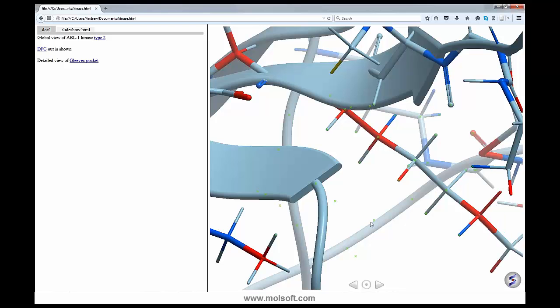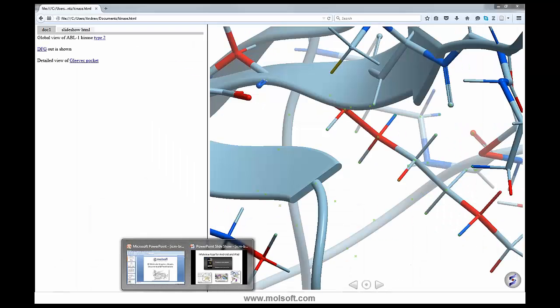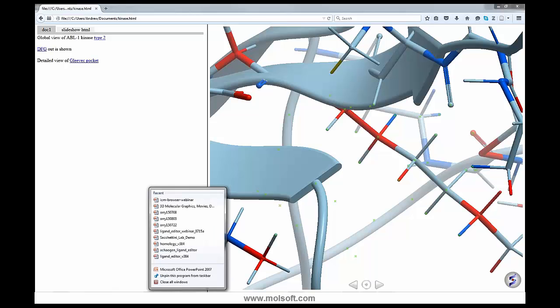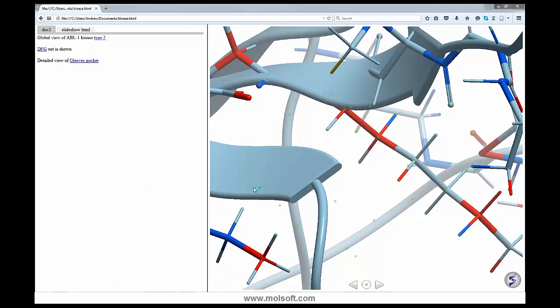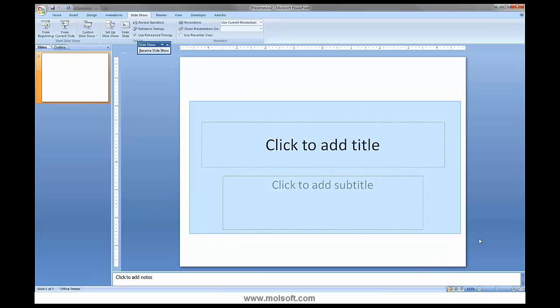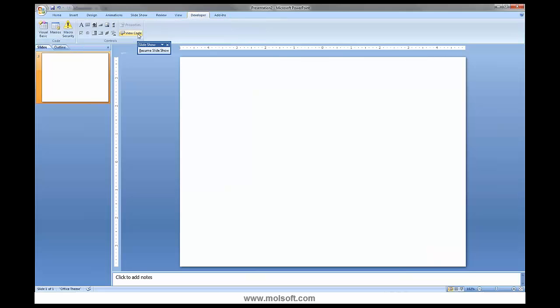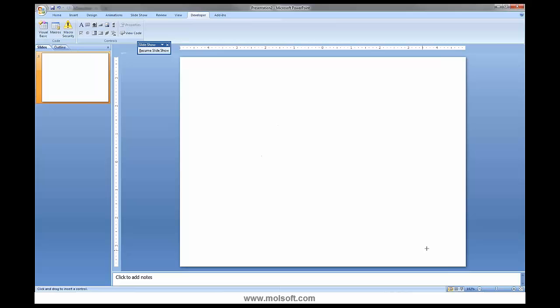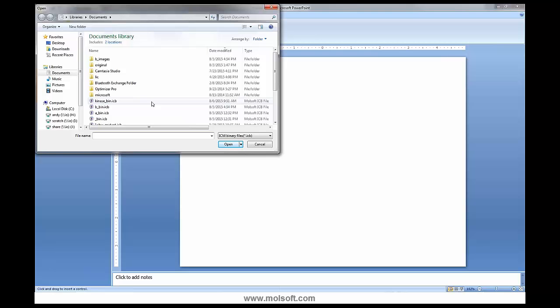Okay, so also sometimes it's useful to put it into a PowerPoint presentation. So you need to download Active ICM to do this. Just need another PowerPoint session here, and if you've downloaded Active ICM, you go to the developer ribbon, and you'll see this button here, and you will see Active ICM class. Click on that, go OK, define the size of how you want to import it, and then choose the ICB file format.